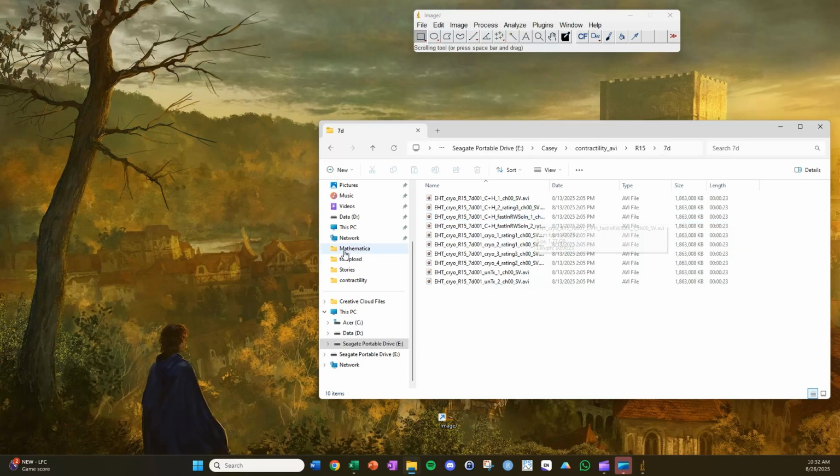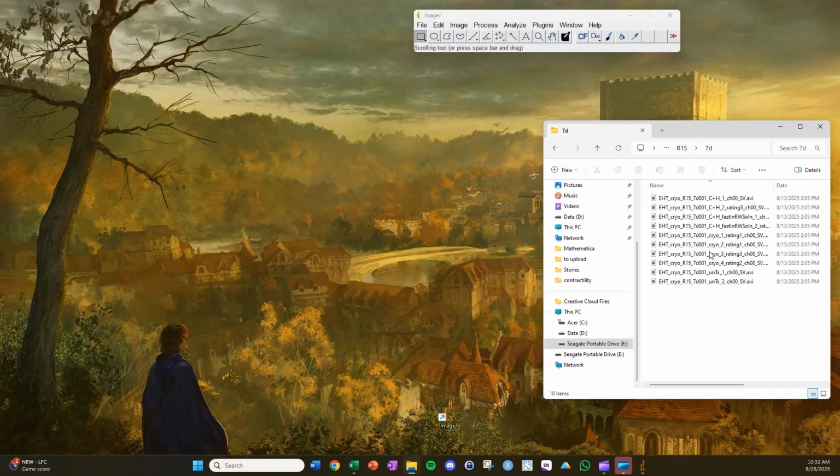All right, so we have the videos here. So that's all good. I would recommend having not more than about 15 videos in a folder, if you're using a computer with like 16 gigabytes of RAM, perhaps more.